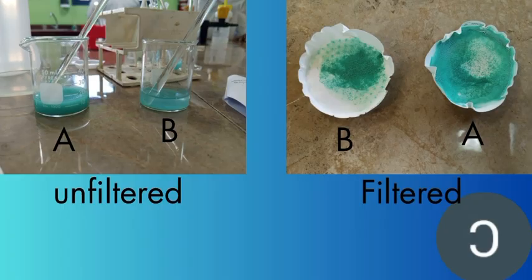Pure solutions: copper 2 chloride ions give this solution a blue-green color. Sodium carbonate ions, however, are colorless in solution. Next, implications of filtrate color.